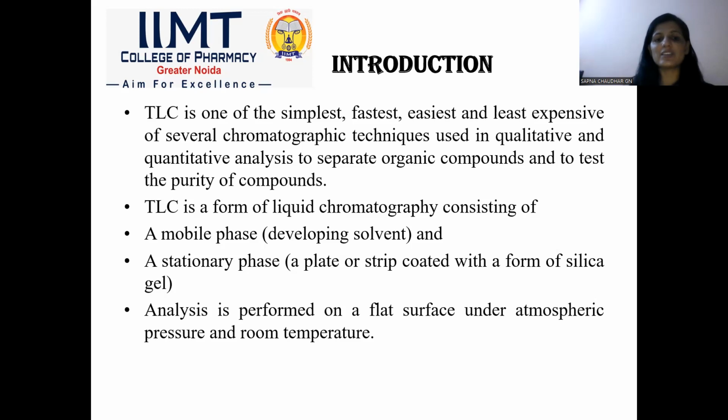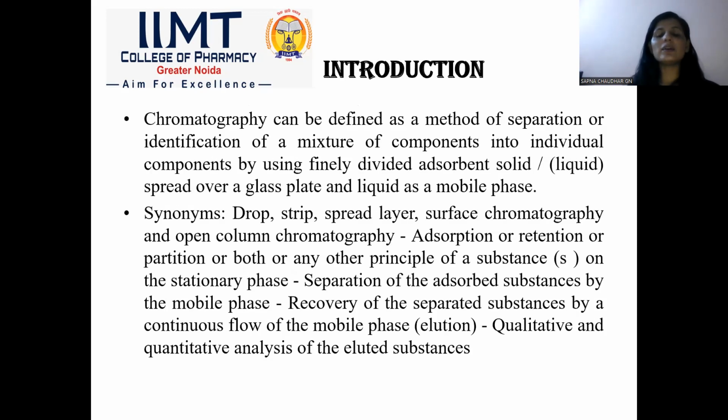And second is the stationary phase. A plate or strip coated with silica gel is used as the stationary phase in TLC, and the analysis is performed on a flat surface under atmospheric pressure and at room temperature.